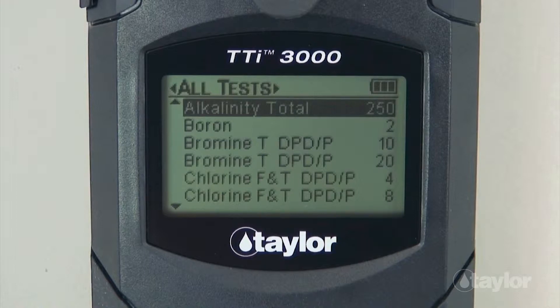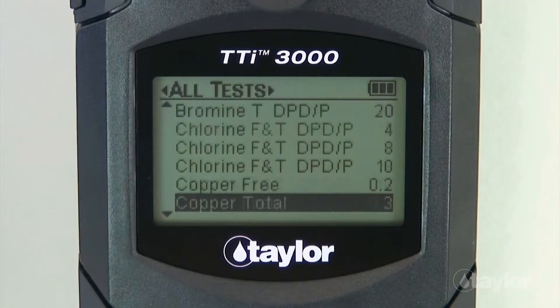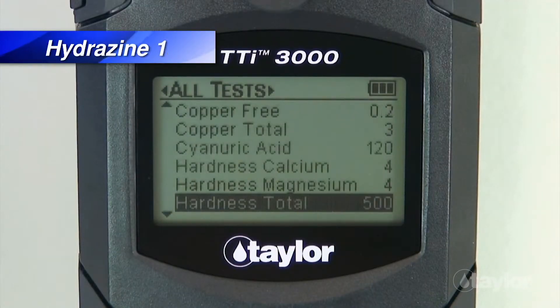If you have added the hydrazine 1.5 test to your Favorites menu, it can be found there also, or in the Recent Tests menu if it's a test you have performed within your last 10 procedures. Scroll up or down to locate the hydrazine 1.5 test, then press Enter.